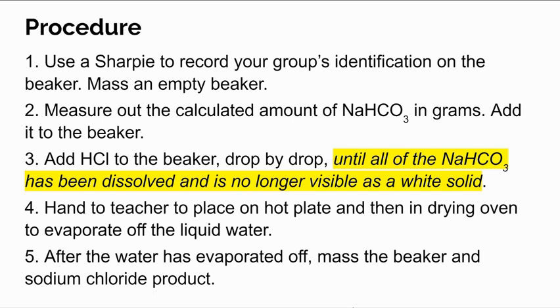Hand your beaker to your teacher to either place on a hot plate or in a drying oven to evaporate off the liquid water. And once the water has evaporated off, mass the beaker and the sodium chloride product that remains.